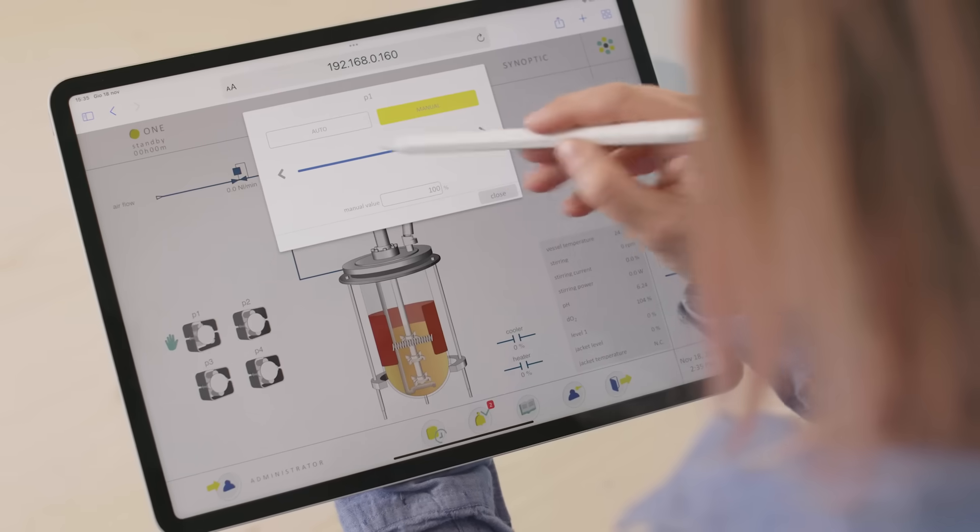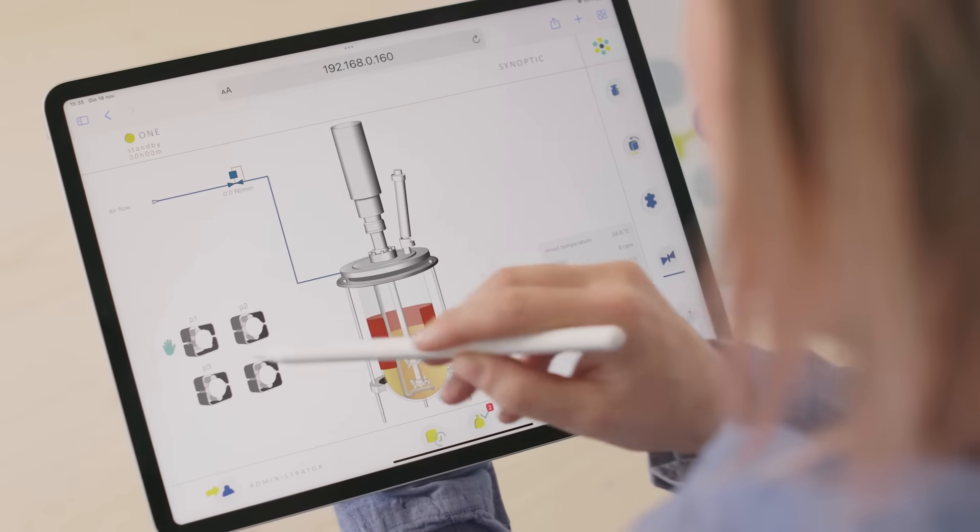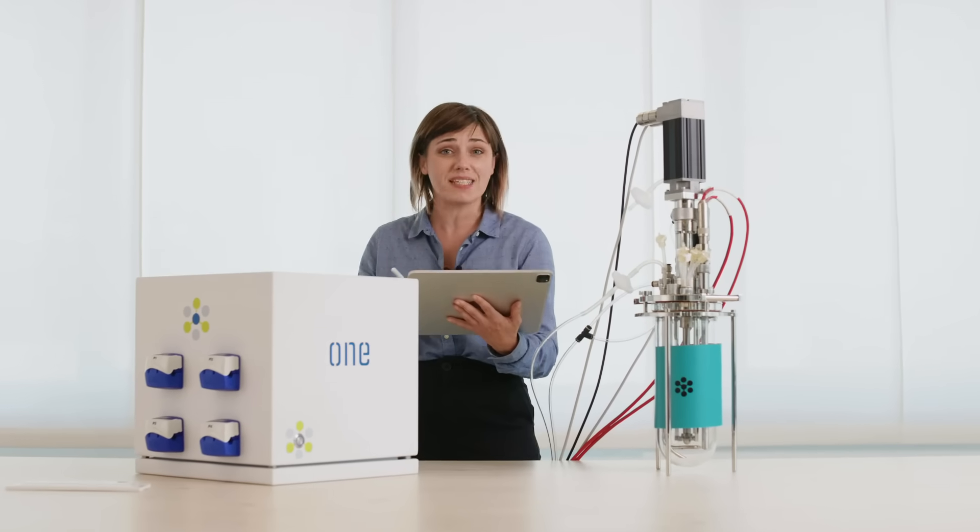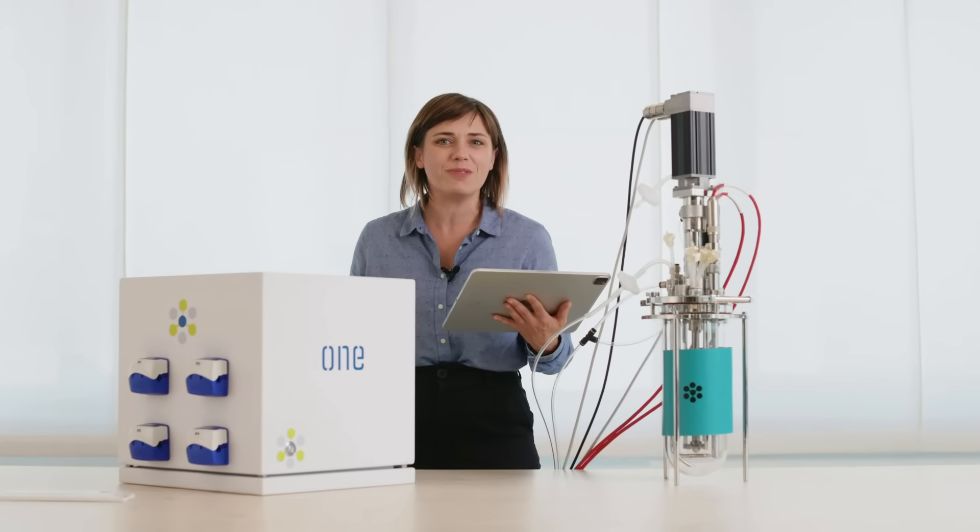Leonardo software license is included in the one supply and can be installed on client's PC, tablet, or smartphone. Wireless approach for increased mobility - users can roam around the lab or reach the office without losing their connection with the running batch.